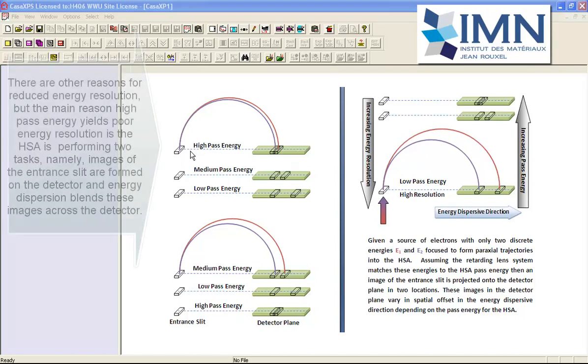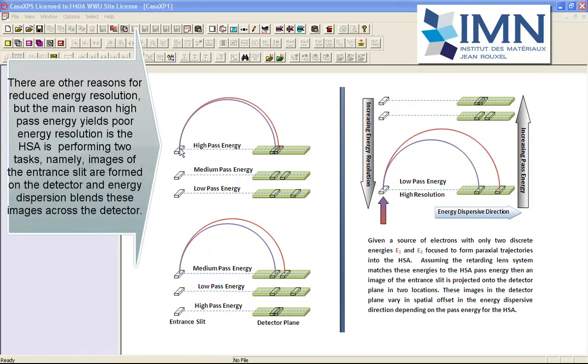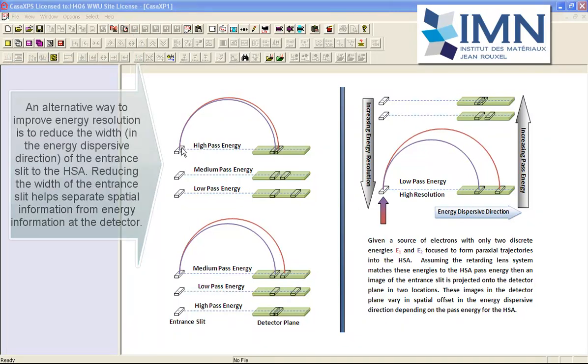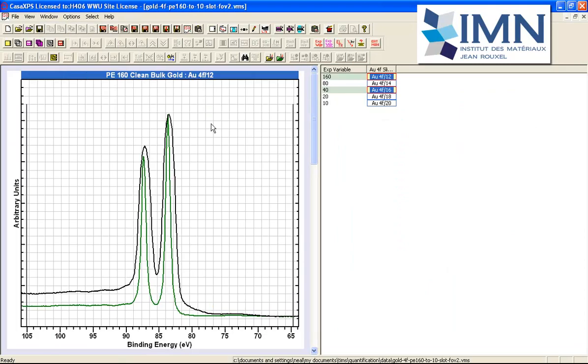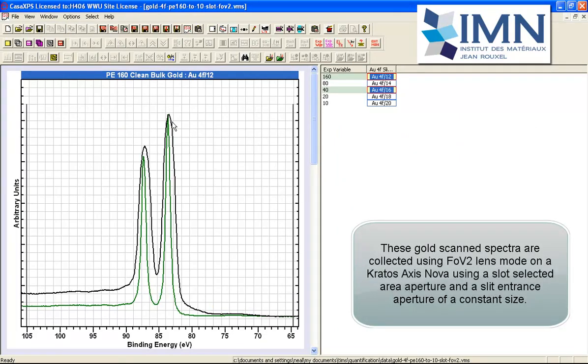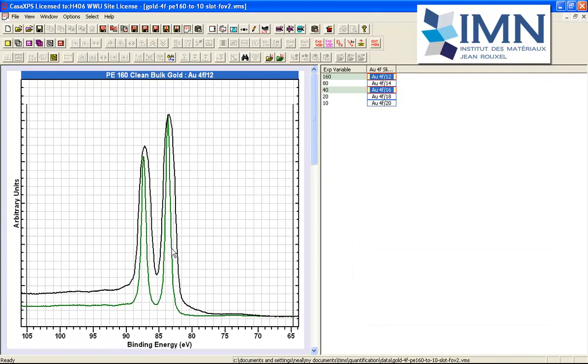The reason that we have broad peaks for high pass energy is that the hemispherical analyzer is performing two functions: it's creating images of this entrance slit and it's also separating the energy in terms of position on the detector for these images. It's this blending of spatial and energy information that is causing the broadening of these peaks. If we look at the gold 4F, you can see that this is the 4F at pass energy 160 compared to pass energy 40. The pass energy 40 spectrum is narrower because there is less confusion between spatial and energy information.